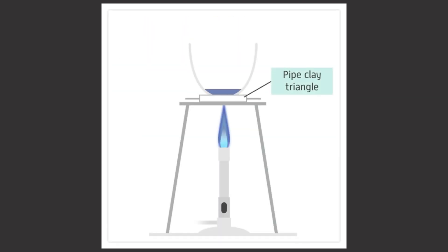The crucible needs to be placed on a pipe clay triangle and heated on a tripod with a blue Bunsen burner flame for several minutes. The pipe clay triangle is a piece of equipment used to hold the crucible on the tripod. You need the flame to be as hot as possible so you hear a roaring noise. Make sure the air hole on the side of the Bunsen is fully open to achieve this.